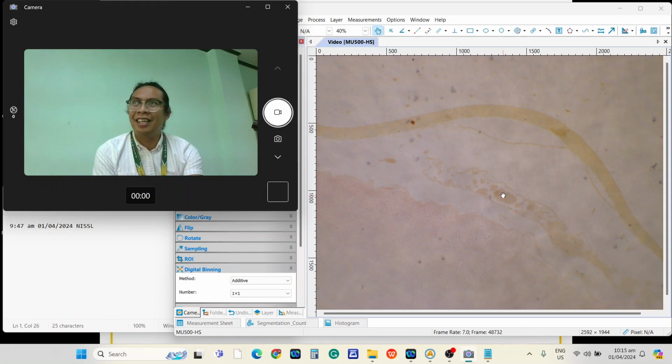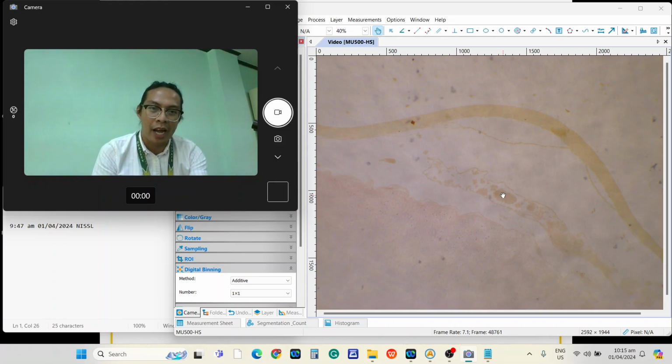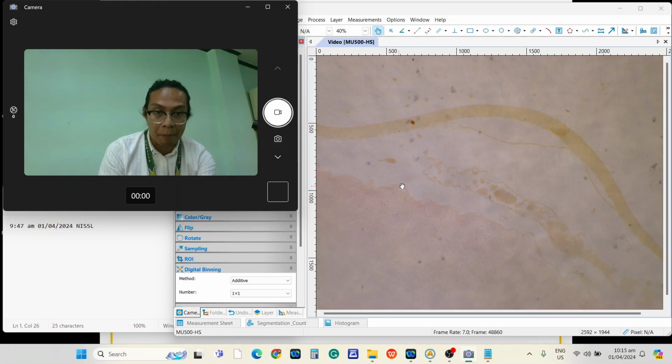So it is not a strict layer because again, siya ay web ng connective tissue. Makikita natin dyan ang mga blood vessels such as these. These are blood vessels. Merong mga loose tissue. So those are loose tissue na nakakabit in between the pia mater and the dura mater. Okay?